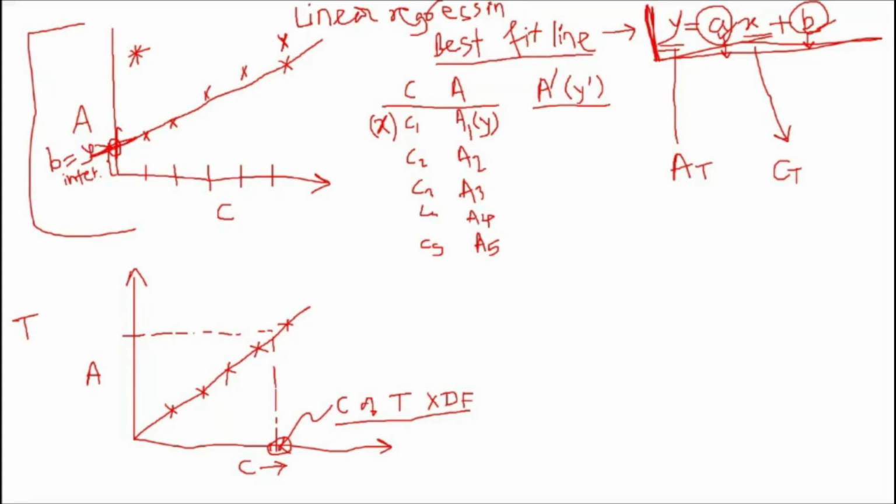After you find corrected absorbances, you will proceed for interpolation by drawing first the calibration line. After interpolation, you will get concentration of test solution, multiply by that dilution factor to get original concentration. Now use the equation of that line and find out concentration of unknown by equation.